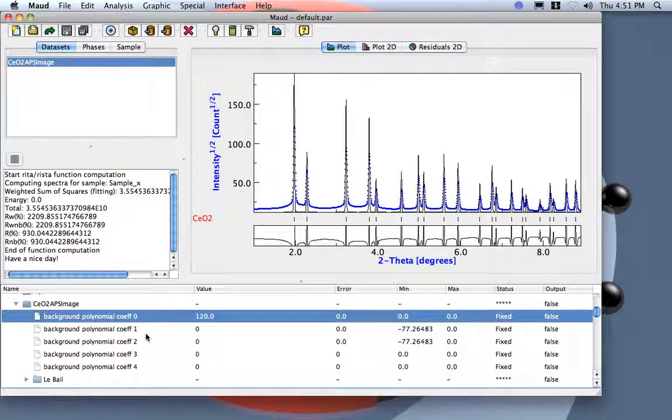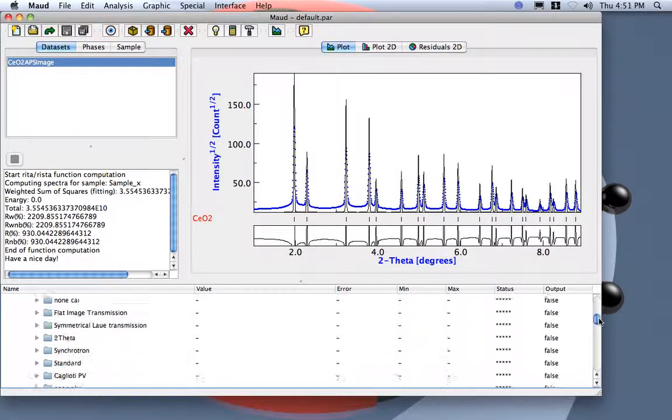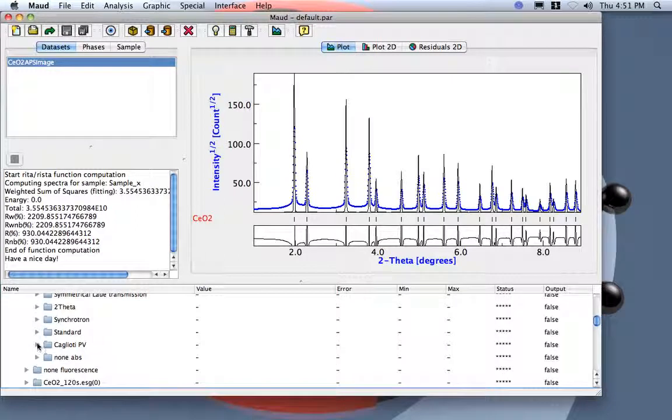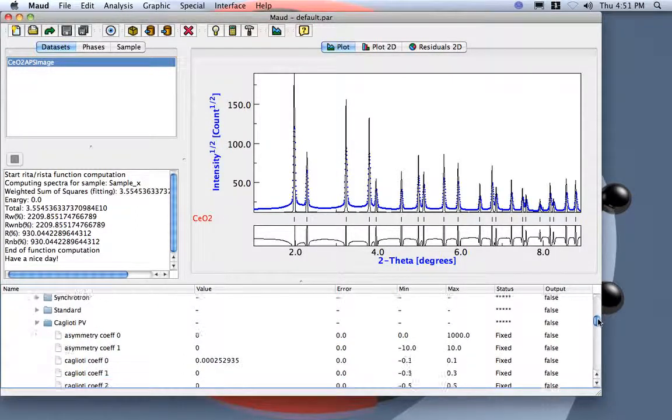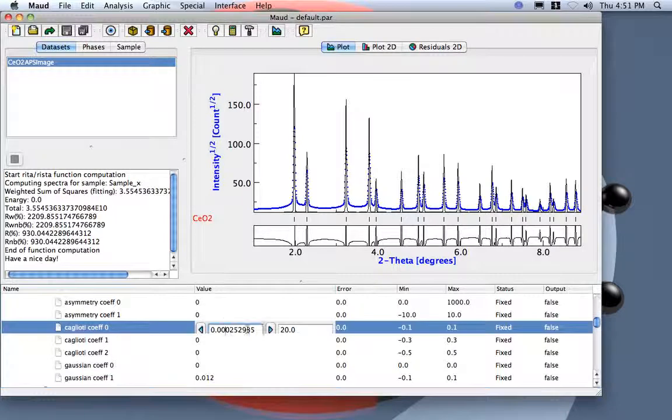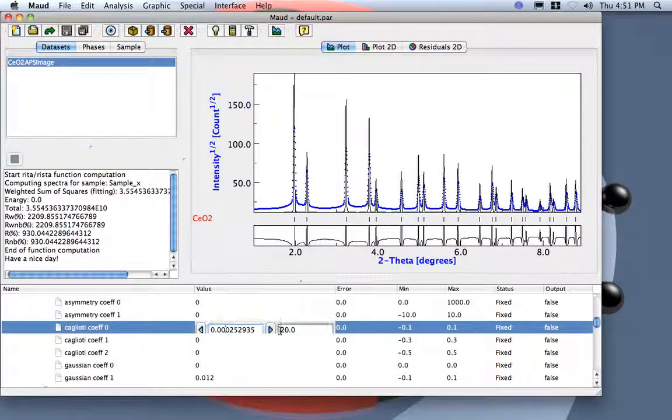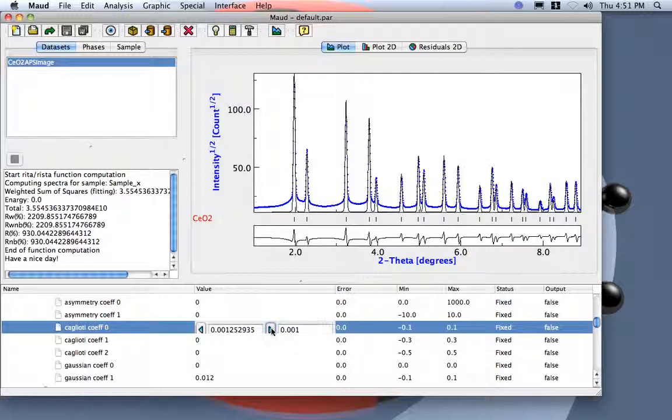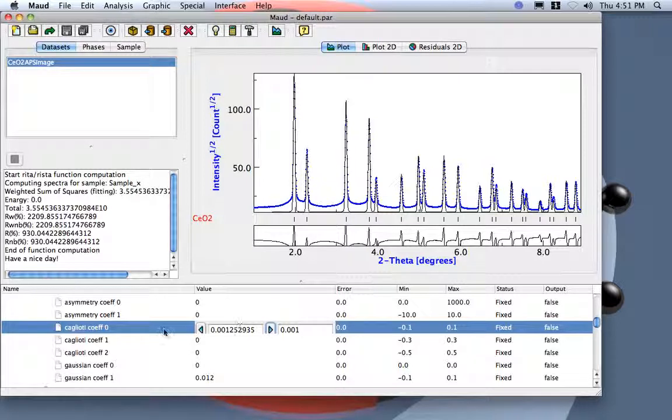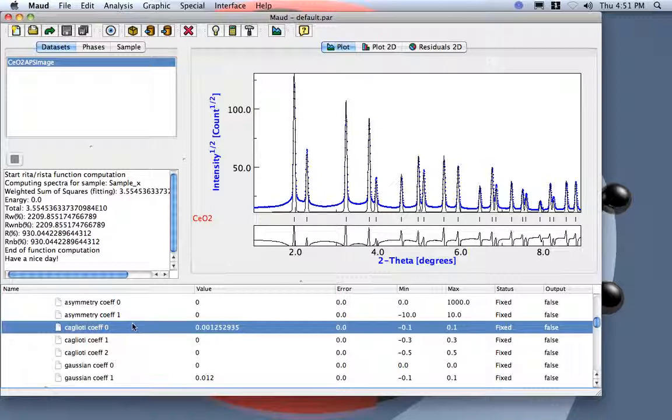And we can check also what happens if we work a little on the Cagliotti here. For example, we go and we change this value by 0.001. It's already too big. Let's leave the program to refine.